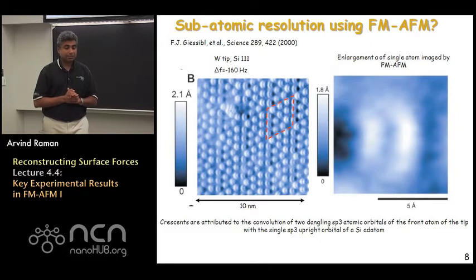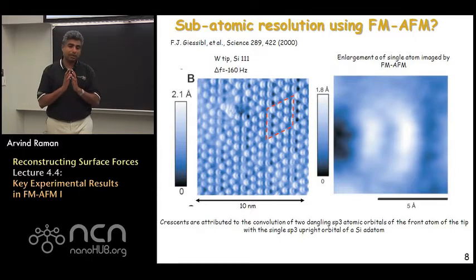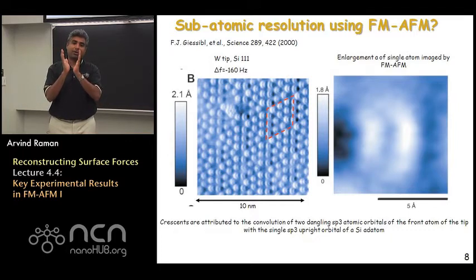And this brought up an interesting question. How is it possible that there might actually be a modulation of the height within an atom? Where does that come from? This is entirely unanticipated because with silicon-111, one expects to see one unpaired sp3 orbital sticking straight out, perpendicular to the substrate, which would then result, if you had a normal tip, in a nice circular symmetry of the image that one acquires.